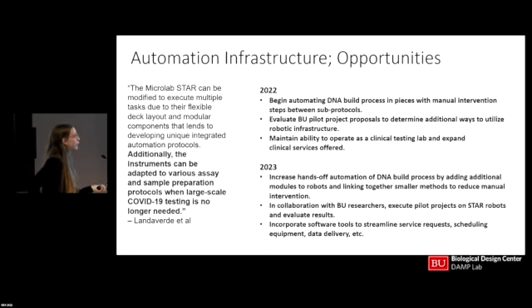This is definitely important, especially scheduling equipment and service requests. I think that also on a software standpoint, the clinical testing lab is using eLabs, which is not necessarily open source, and the DAMP lab would like to be more of an open source network, but it's harder to be open source as a clinical lab. So that's another hurdle that we are facing.